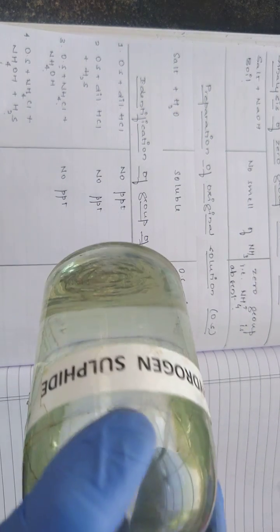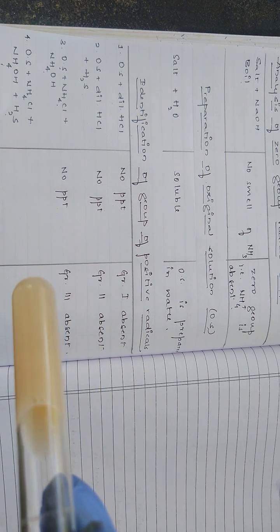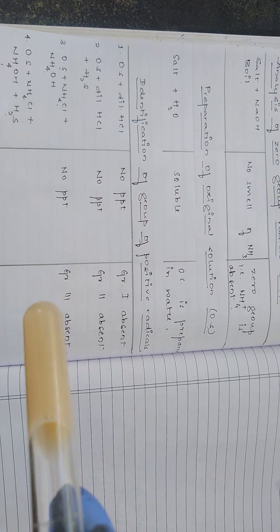This is the hydrogen sulfide reagent bottle. So the observation that we are getting, you can see here, is brown precipitate.